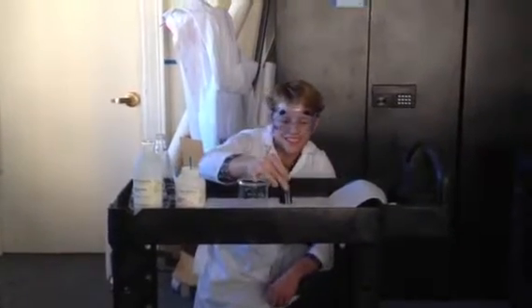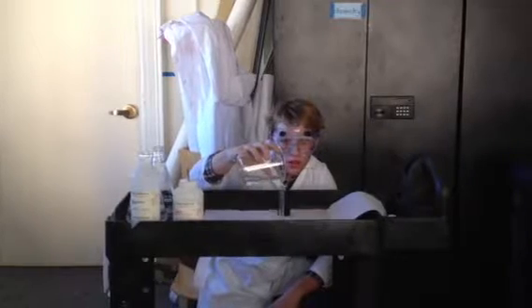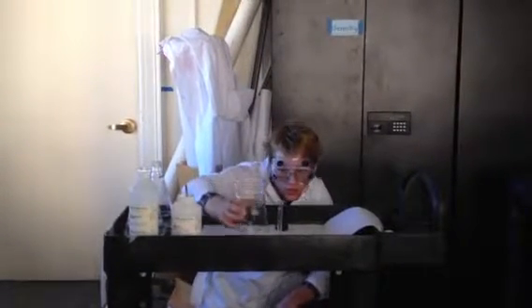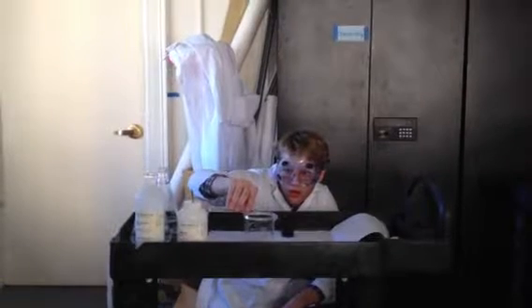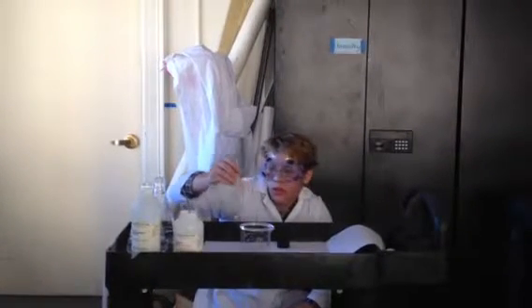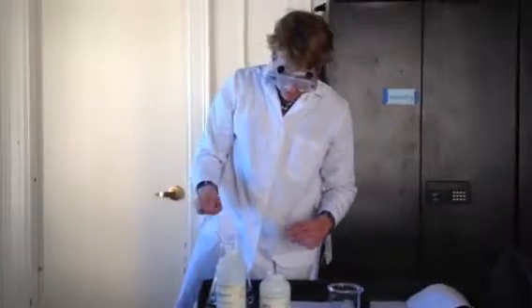Dang it. This is a really hard thing to balance out. Alright, just a little bit over. I'm going to take this sodium hydroxide and pour it into there.